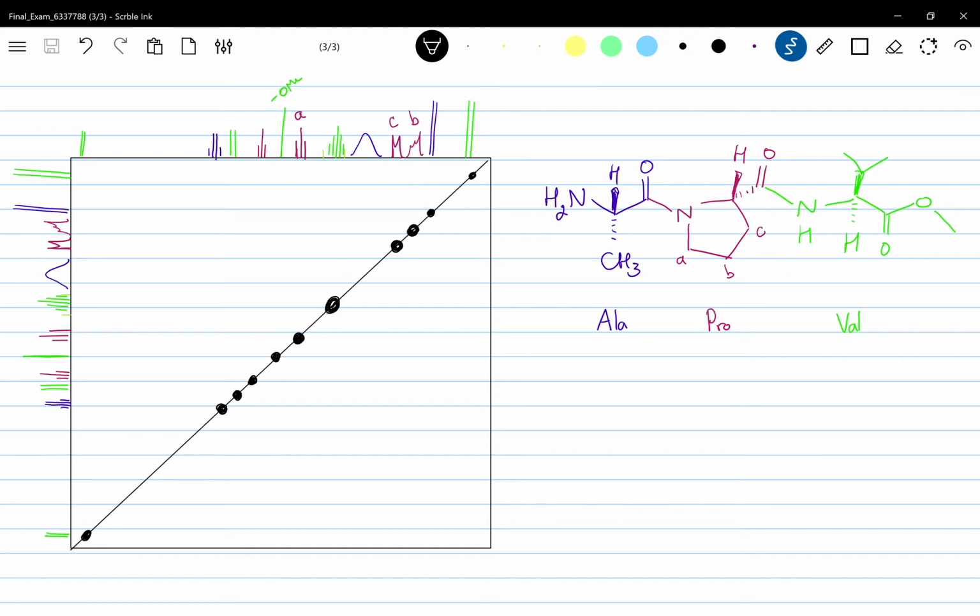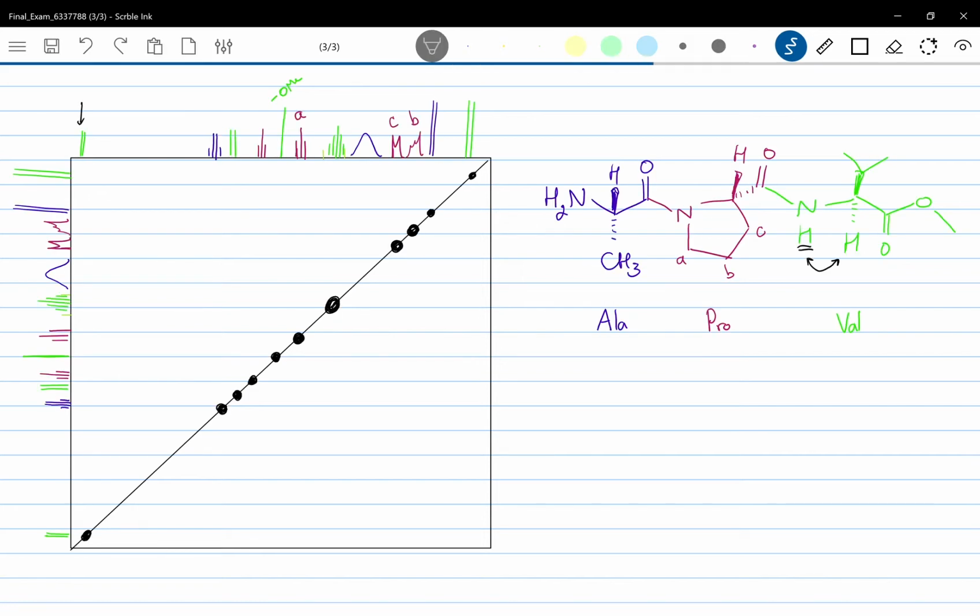Okay. So let us start with the same NH proton, the green one, which is this one with the most downfield chemical shift. Even though it might have interactions with this nearby alpha proton of itself, we'll try to exclude the J coupling interaction, which can be found in COSY. So we won't be talking about this interaction.